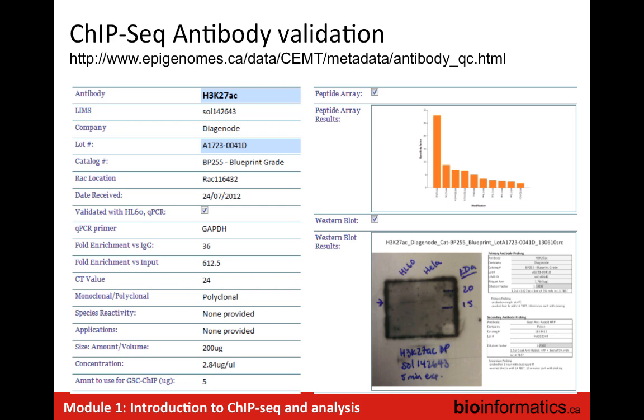Garbage in, garbage out. Okay. So, sorry, would this pass the validation or not? This one did, yeah. But this is as good as it gets. I mean, we've had one where, with a commercial antibody, the first peptide it recognizes a different acetylation moiety. And this is common, unfortunately.